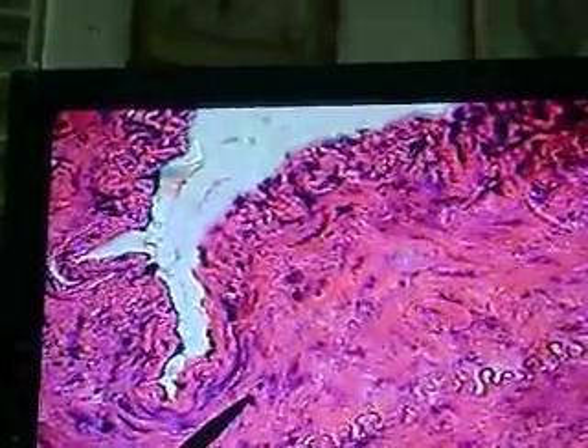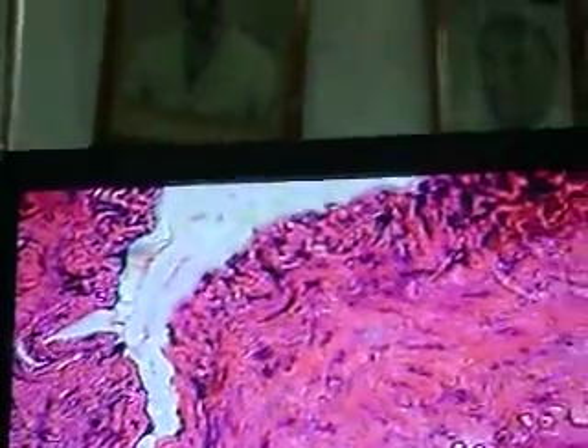You have to create these pictures in your mind. That's an elastic artery, and it asks a number of little questions about it. Now here is one that is just stained with what's called Burrhoff's elastic stain — this is just to show the elastic tissue component.